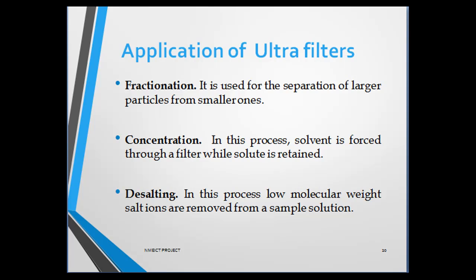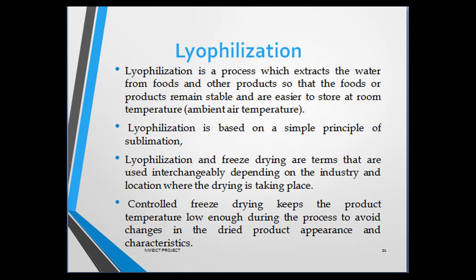The third separation technique is lyophilization. Lyophilization is a process which extracts the water from food and other products so that the food or the product remains stable and is easier to store at room temperature. Lyophilization is based on a simple principle of sublimation. What is sublimation? Sublimation is a transition of a substance from the solid to the vapor state without first passing through an intermediate liquid phase.